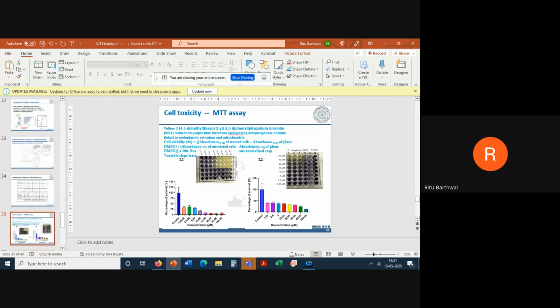Literally it is that. So we take this and we add different concentrations of our drug sample. Supposing this is the control. Then we add the drug in different concentrations and make this plot so that we get the IC50 value, the inhibitory concentration where 50% inhibition has taken place. So we know the cells are getting killed.